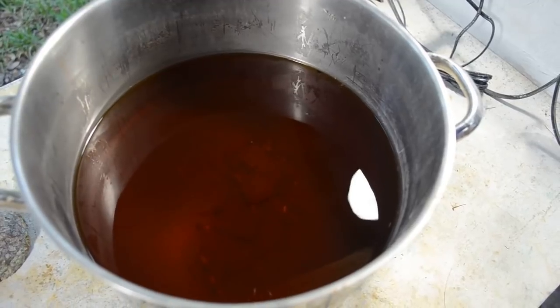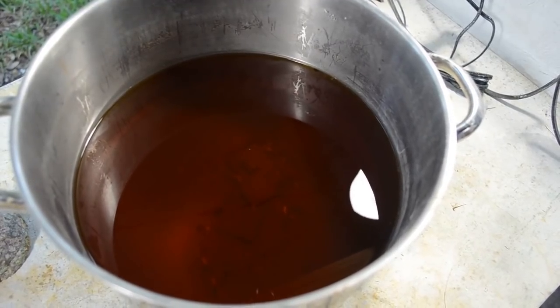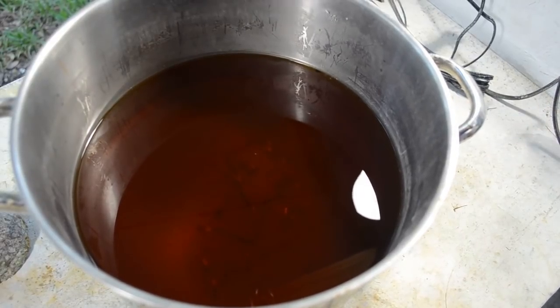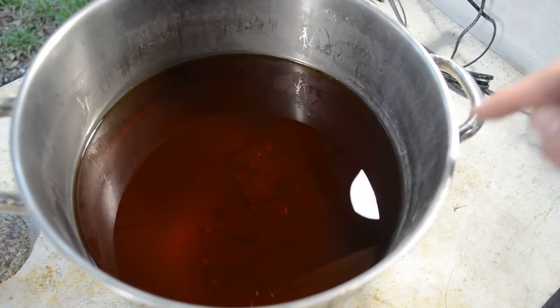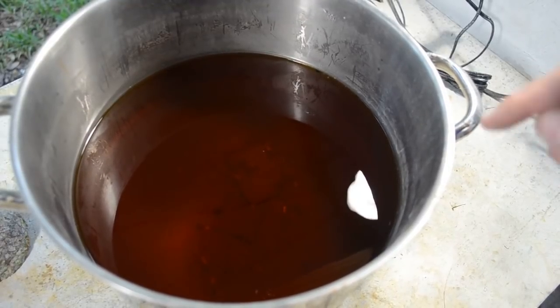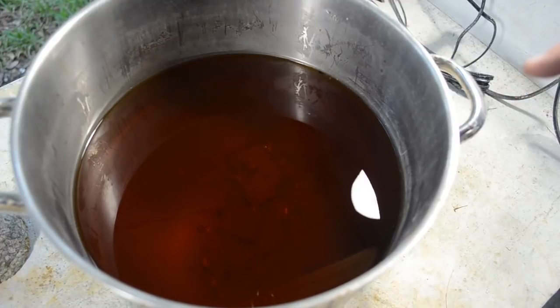So I'm going to have to do this in several batches. I will set up my vacuum filtration system and put this through my Buchner funnel with a nice filter in it. And I'll probably have to do this in three batches because my filtration flask is only 2 liters in size. So I will get all set up for that and then we'll be back to filter this.